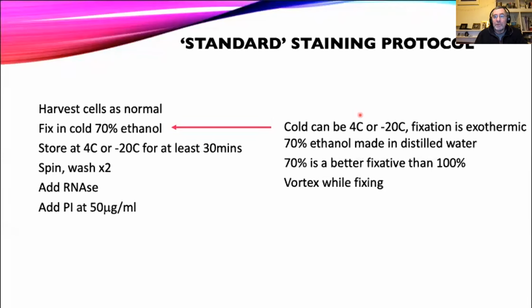And the reason it's cold is because the process of fixation is exothermic. We don't want our cells to boil or to change their morphology or their makeup during the process of fixation. So we use a cold fixative.